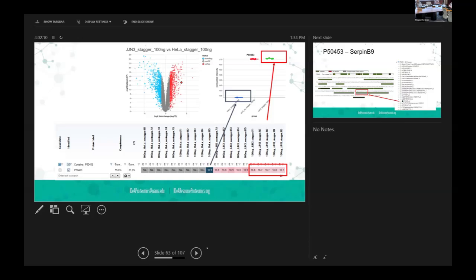What I didn't realize, because I'm not the biostats person, but I have to give a shout out, is that every time I did this, it would yell at me because it says, hey, you have too many to fit the model, which I think is like 20% or something. So the idea is that your proteomic changes aren't going to be dramatic in more than 20% of your proteins expressed there.